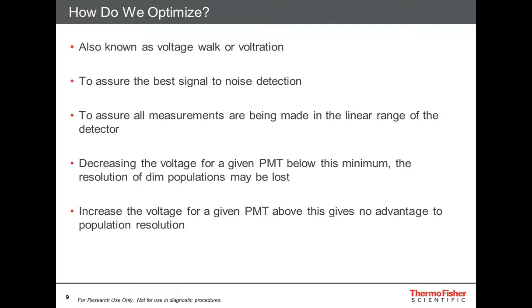So we realized that we needed to understand a lot more about PMTs. We needed to set voltages that were appropriate for our experiments. So we needed to do some optimization that's now been called either a voltage walk or a voltration.